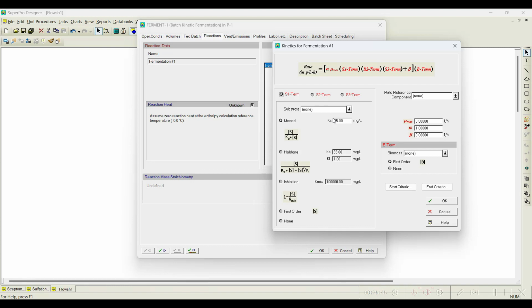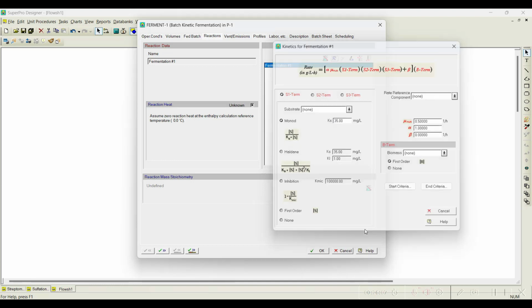That is the reason, whenever fermentation aeration is there, when a pure fermentation is going on, it is better to choose this kinetic fermentation option. In some cases during fermentation, we represent just a reaction, the conversion of one compound to another component. At that time we can go with the batch kinetic react operation instead of the fermentation operation. So click OK.